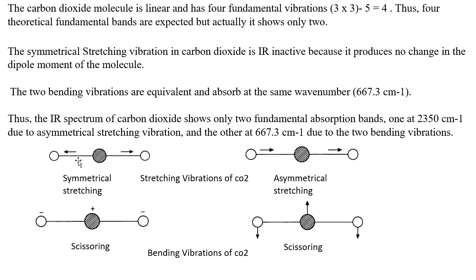Similarly, the 2 bending vibrations are equivalent and absorb at the same wave number, that is about 667.3.